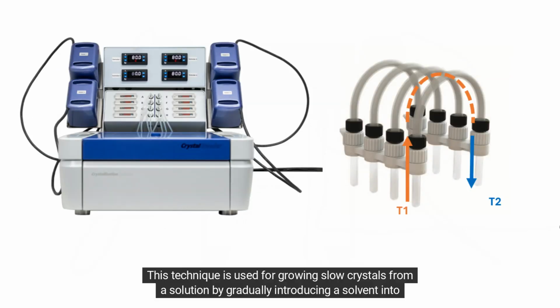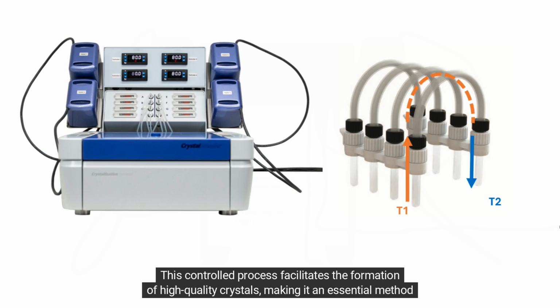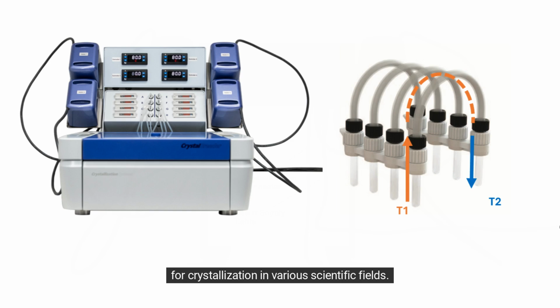This technique is used for growing slow crystals from a solution by gradually introducing a solvent into the saturated solution. This controlled process facilitates the formation of high-quality crystals, making it an essential method for crystallization in various scientific fields.